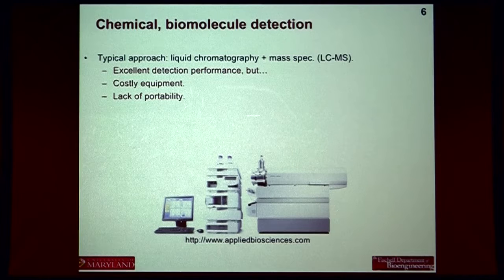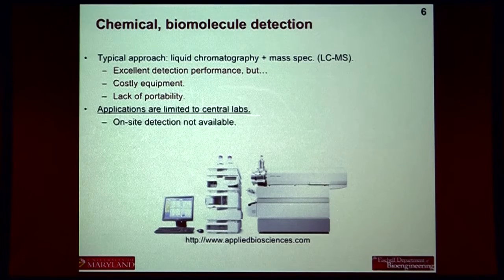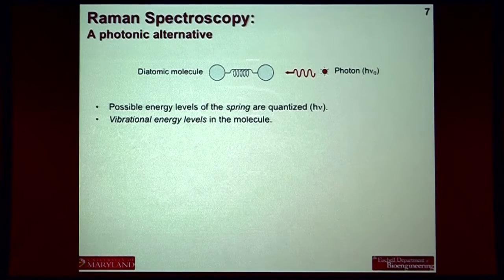What we envision instead is being able to take a small kit in a backpack out to the source, do the testing right on the spot. And really, HPLC MS doesn't allow us to do that because of its characteristics of being large, bulky, way too expensive, with sophisticated needs. So there are literally thousands of groups around the world looking at ways to address this problem.